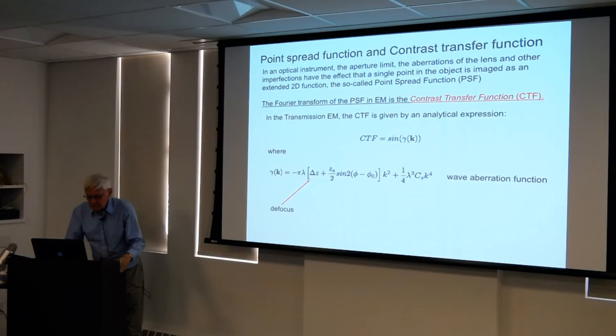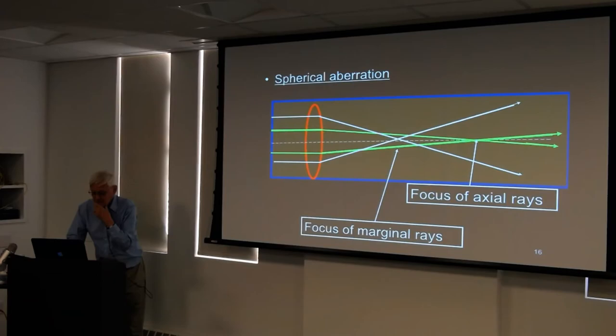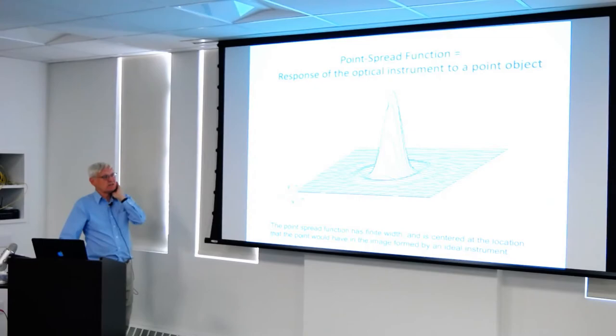Okay, that comes a little late. I already told you that. This is essentially a replay of the image that I showed you before. Now is the point spread function.